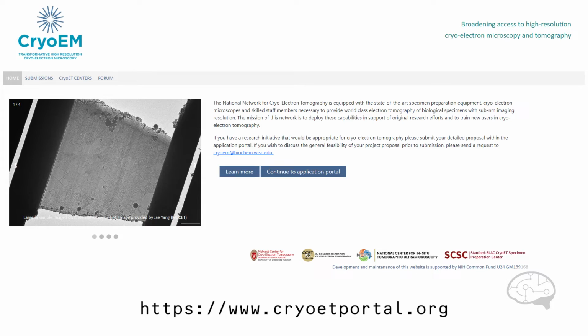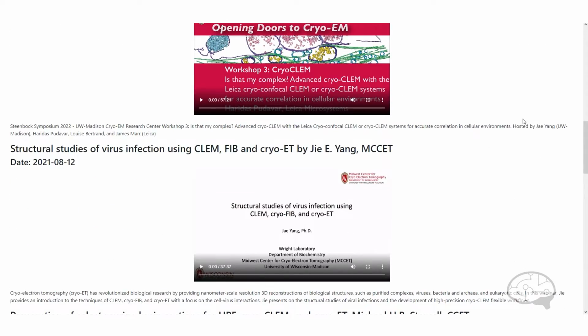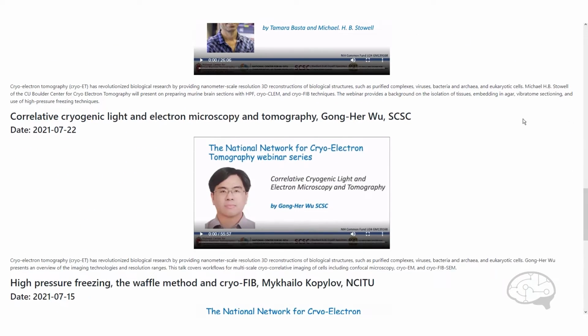Okay. So if people were interested in getting into the facility, getting training, and having access to the instruments, what do they need to do? Well, the first step is I would direct you to www.cryoetportal.org. Hopefully we'll have a splash screen which will show this beautiful website, but it's a common application portal and information source for the 4 different service centers. You can see past training and instructional webinars that we've hosted. You can also find out about each of the individual facilities, the equipment that's available, and last but not least, you can start your application.